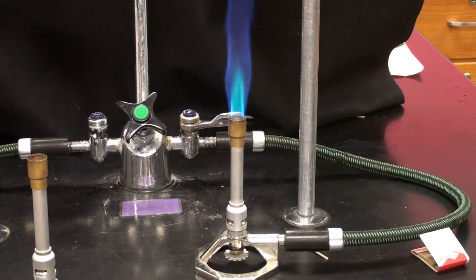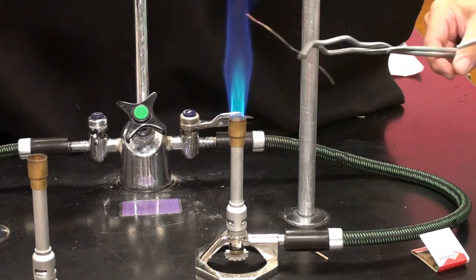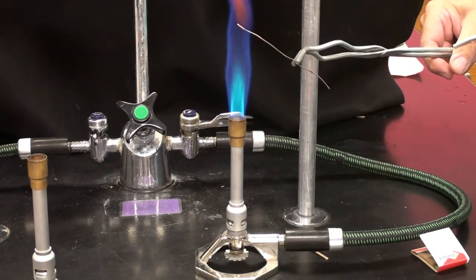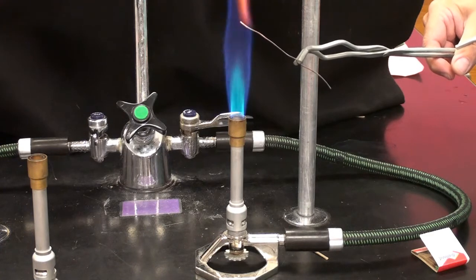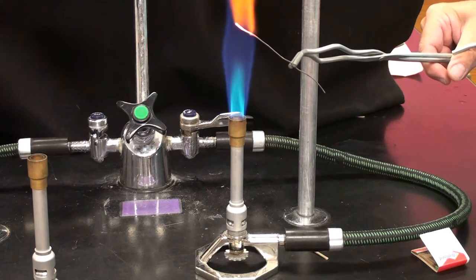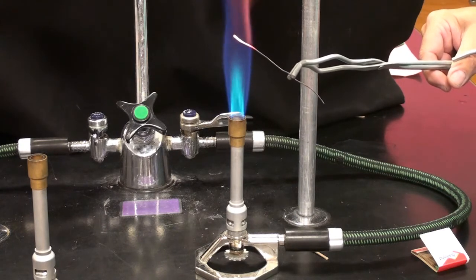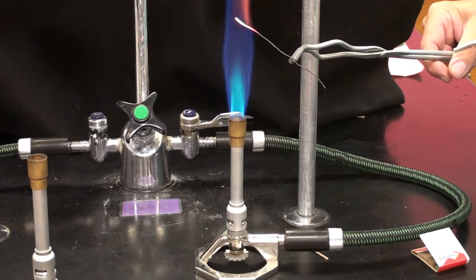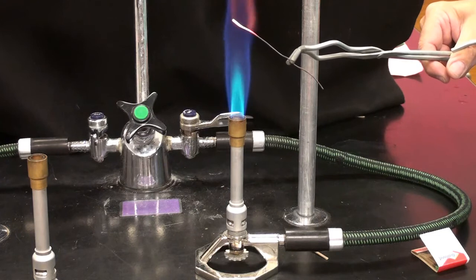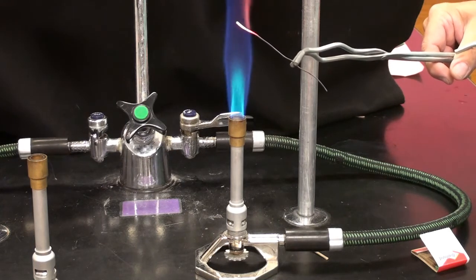So let me clip that off and try again with a part that I know has not been in there so we can see. Right now, this section has not touched the flame. We'll see if we can get a little bead of it starting to show up here. But this is one of those labs where some students never quite find the hot part, or maybe their Bunsen burner isn't giving as hot a flame. This one looks like it might, but it takes a little while. This is really close to the melting point of copper. And maybe if I can get a little bead to show up there, it might be just a little bit above the melting point of copper.